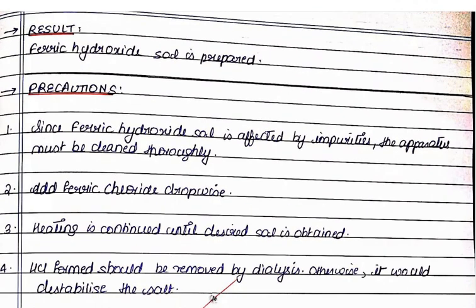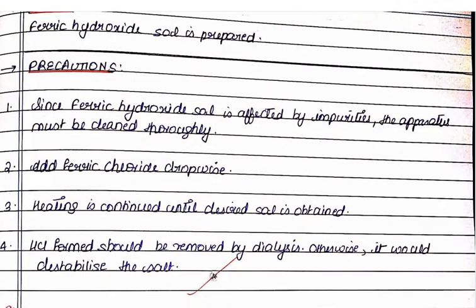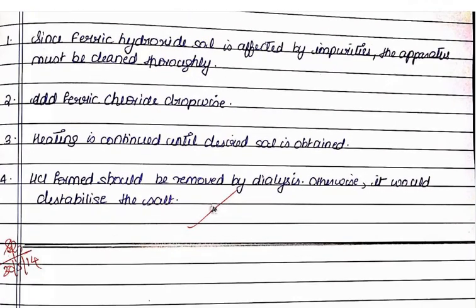Precautions for this experiment: First, since ferric hydroxide sol is affected by impurities, the apparatus must be cleaned thoroughly. Second, add ferric chloride drop wise. Third, heating is continued until the desired sol is obtained. Fourth, the hydrochloric acid formed should be removed by dialysis; otherwise it would destabilize the sol.